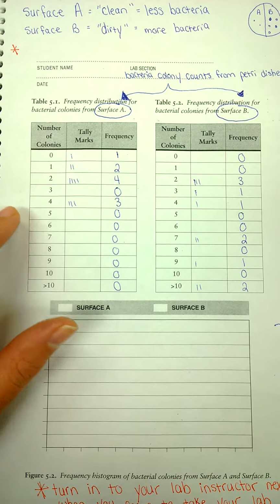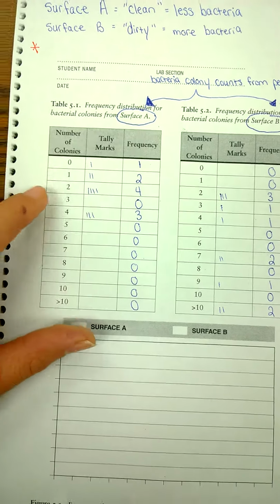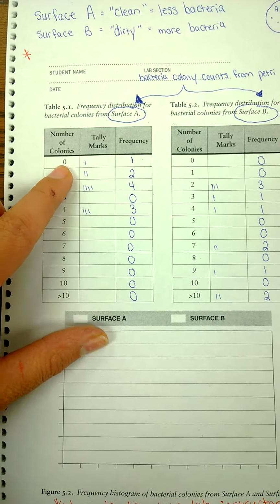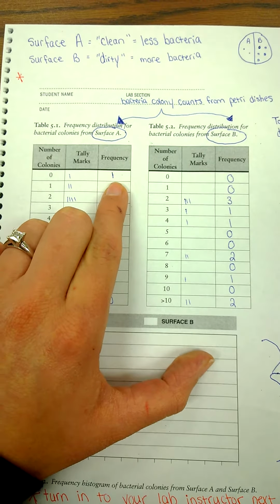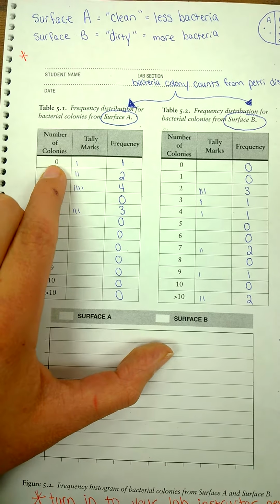For example, as a class, we would have counted on surface A how many of you had 0 colonies on side A in your petri dish. In this case, we had a frequency of 1, meaning one petri dish out of the class had 0 colonies on side A.